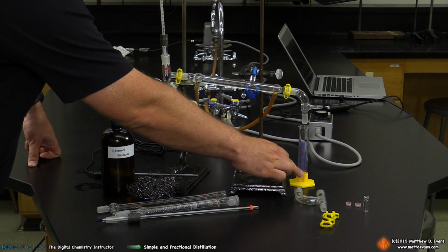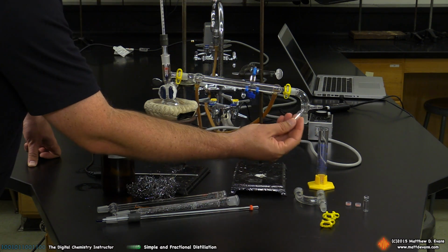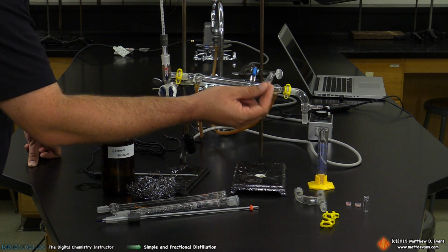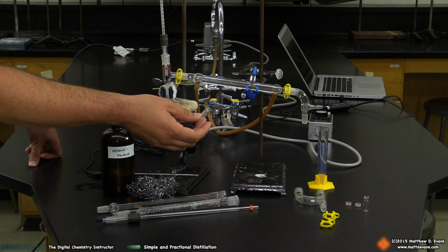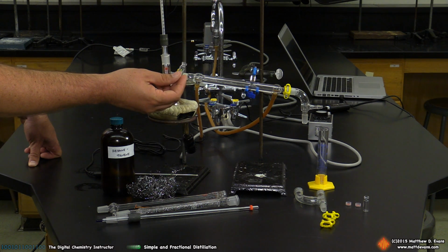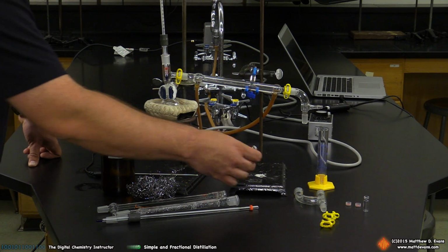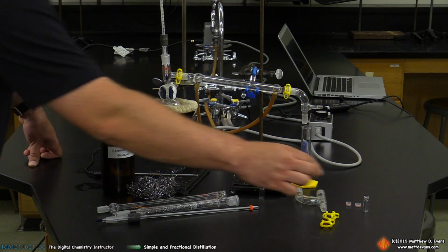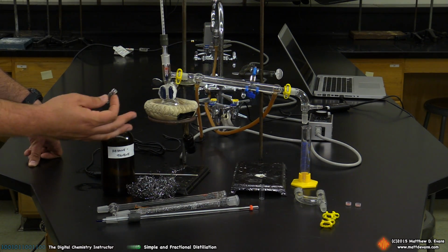At the 4 milliliter collection point, what you're temporarily going to do is move this to the side and collect just enough distillate in this tiny little auto sampler vial, which are available in the cart. You're going to collect about a third's worth of distillate in this vial. We're going to put this on the gas chromatograph eventually to analyze how well we did at the 4 milliliter mark. What we expect after 4 milliliters is mostly hexane, because hexane is the lower boiling point compound. And then later you put this back, you're collecting more distillate. Later towards the 18 milliliter mark, you're going to switch to a different auto sampler vial, collect that distillate, and that should be mostly toluene at that point because that's the higher boiling point.